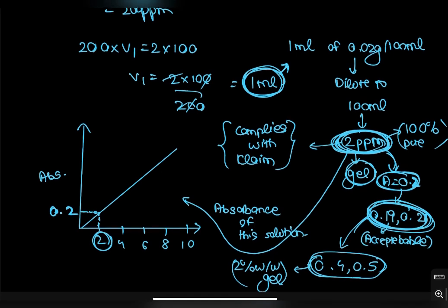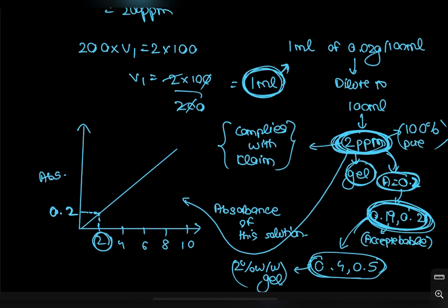So this is how you can basically analyze a particular gel or any other formulation using the calibration curve method by extrapolating the absorbance values. So that was the video.